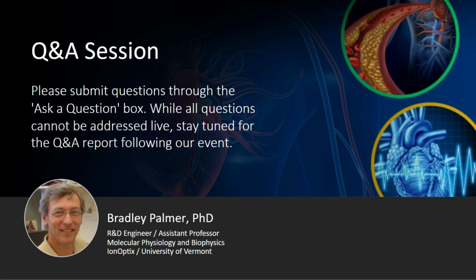Okay, that's great. Would you say what the technical limitations could be, if there are any, other than that it's very small? Yeah, that's really basically it. It's just that it's so small. You want to make sure that you don't lose any myocardium that could otherwise have gone into a slice. So you might want to make thinner slices to begin with to make sure that you're not throwing away myocardium that could be incorporated into a slice. But you still might only get 2 to 4 or so viable slices at the end of the day. Okay, great.